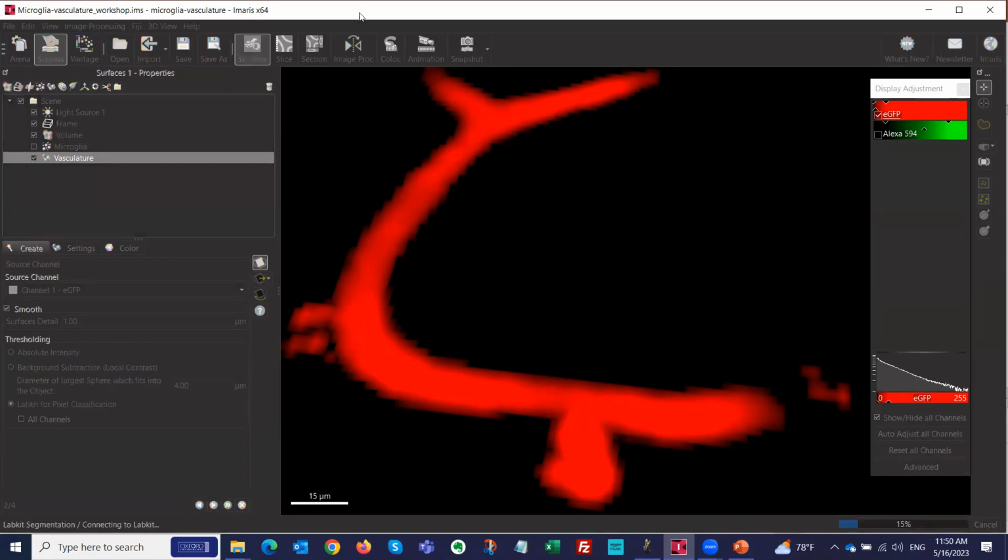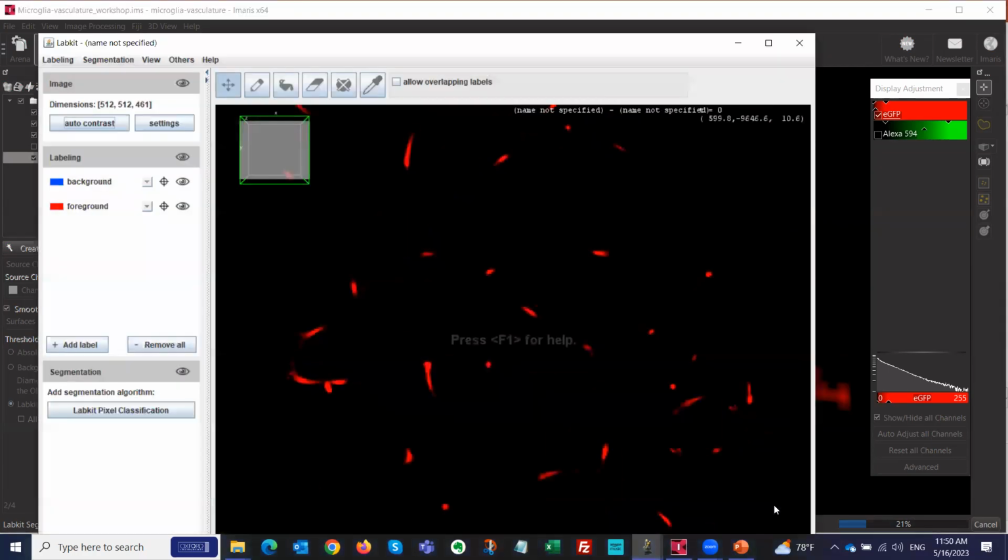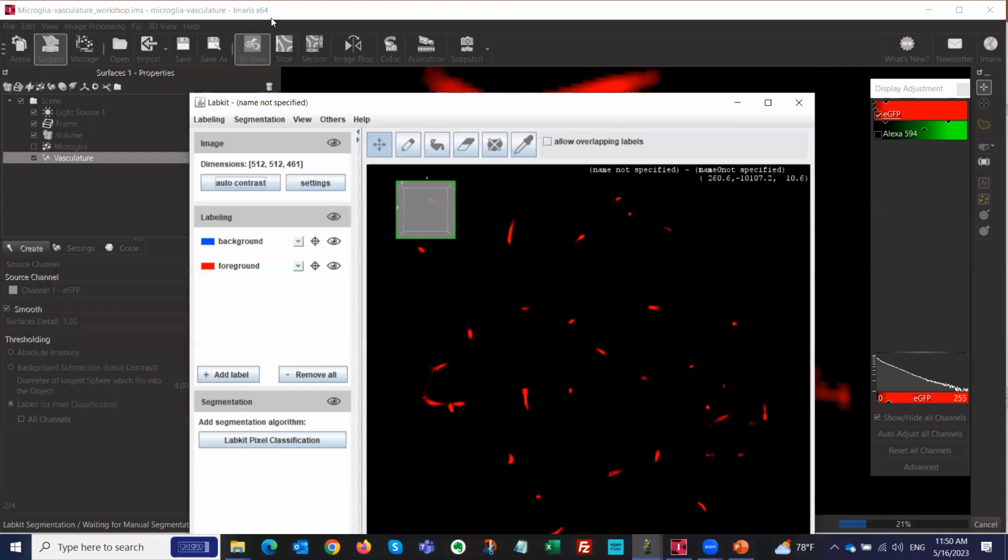It goes to 21. This is already a good sign. Okay, it did work now.